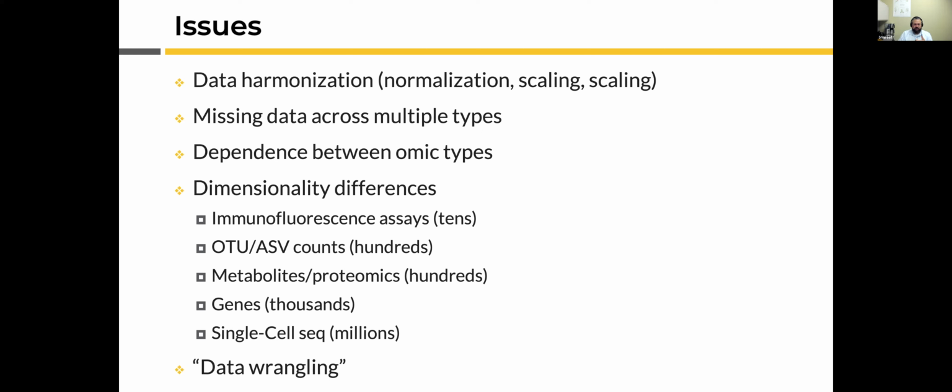And so there's just the challenge of, one, making sure you have all your samples named correctly, that you have all the samples. So just the basics of data handling, to make sure that when you're giving any of these multi-omics analysis methods data tables, those data tables are in the same order across all the samples, and all the samples are named correctly. So that's definitely something you need to keep track of and verify in your code as you're dealing with this sort of stuff.